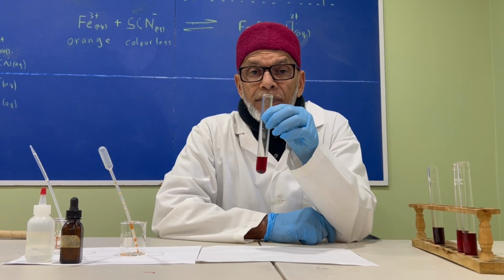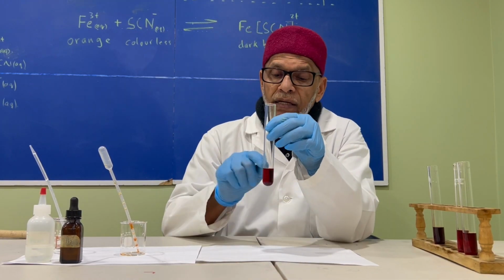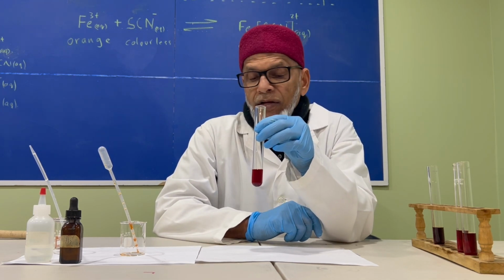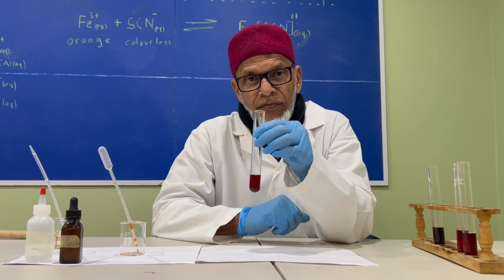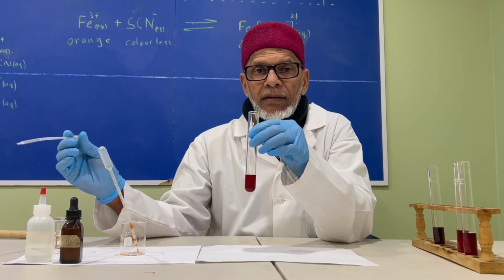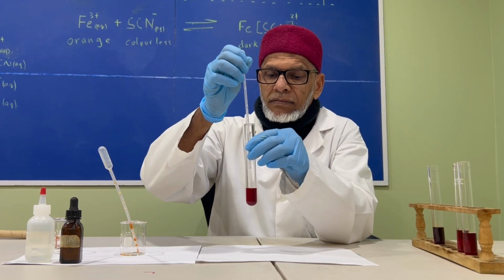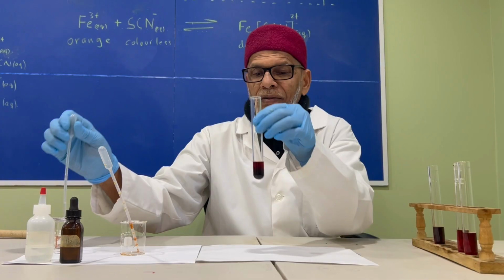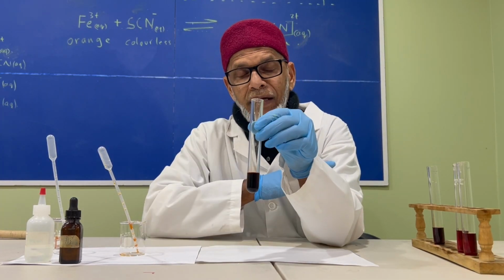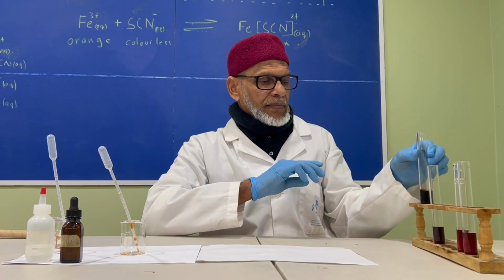In this second experiment, we'll be adding thiocyanate ions to the equilibrium mixture. Again, make a prediction as to which direction you think the equilibrium will shift and what observations will be made. Okay, here we go. What do you observe? Notice how the solution turned darker when thiocyanate ions are added to it.